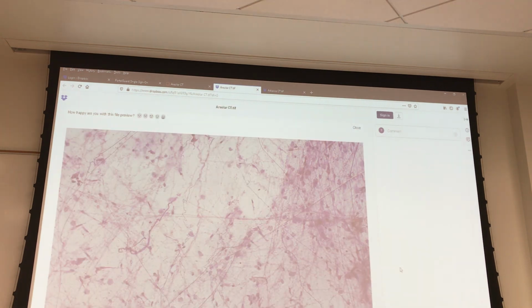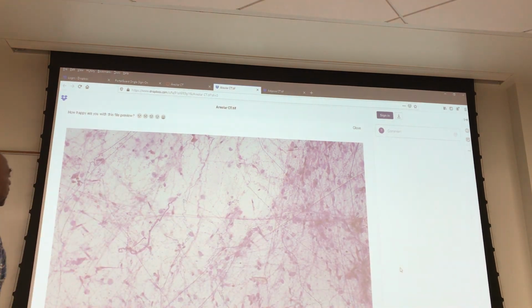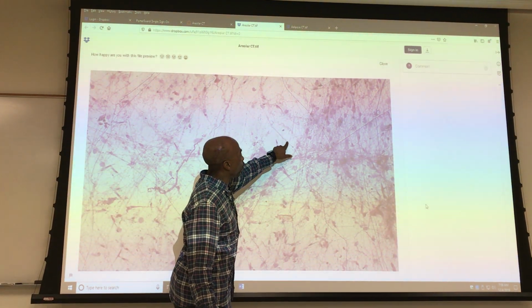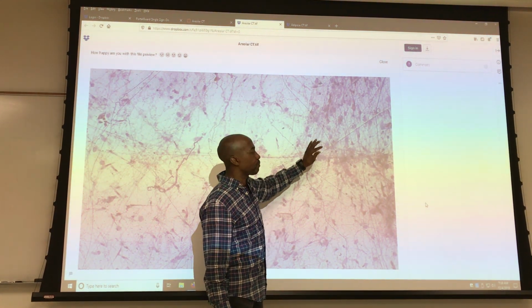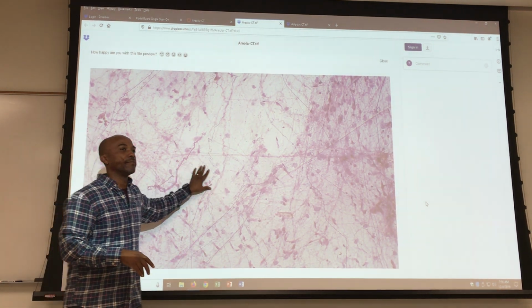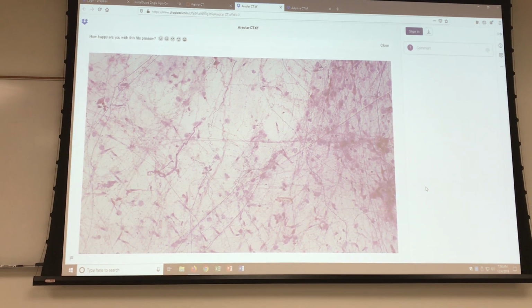This is areolar, showing you these are fibroblasts, these cells. The thickish band in the background, these are collagen fibers, those things. And the thin dark ones are your elastic fibers. As you can tell, thin is elastic, and thicker in the background is collagen fibers. And you can see the space in there. That's areolar. It all looks the same exact way.